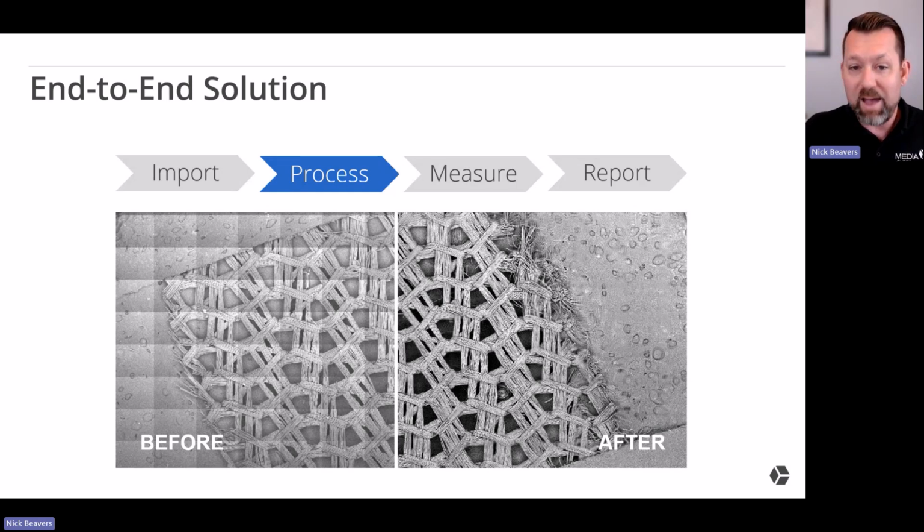One, after the mosaic has been assembled and the overlap is established, we are correcting the shading in every single one of the frames. And then across the entire mosaic, there's actually shading from top left to bottom right that causes an imbalance in the intensity of the pixels at the bottom right versus the top. So across the entire mosaic, secondary shading correction, and then an enhancement of contrast. So you get a really nice image on the right-hand side, high resolution, and it allows you to get that kind of detail where you can actually make proper measurements.